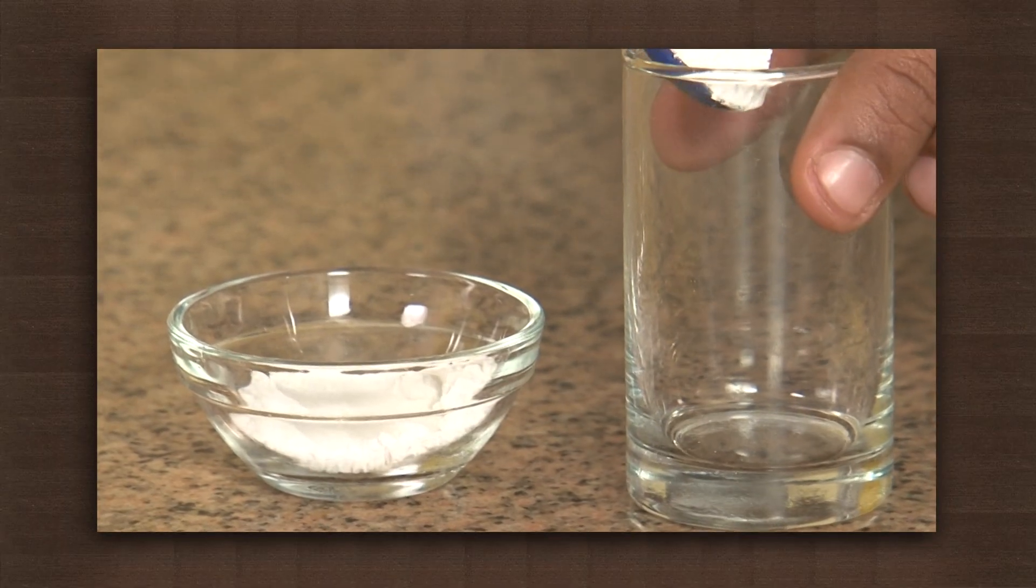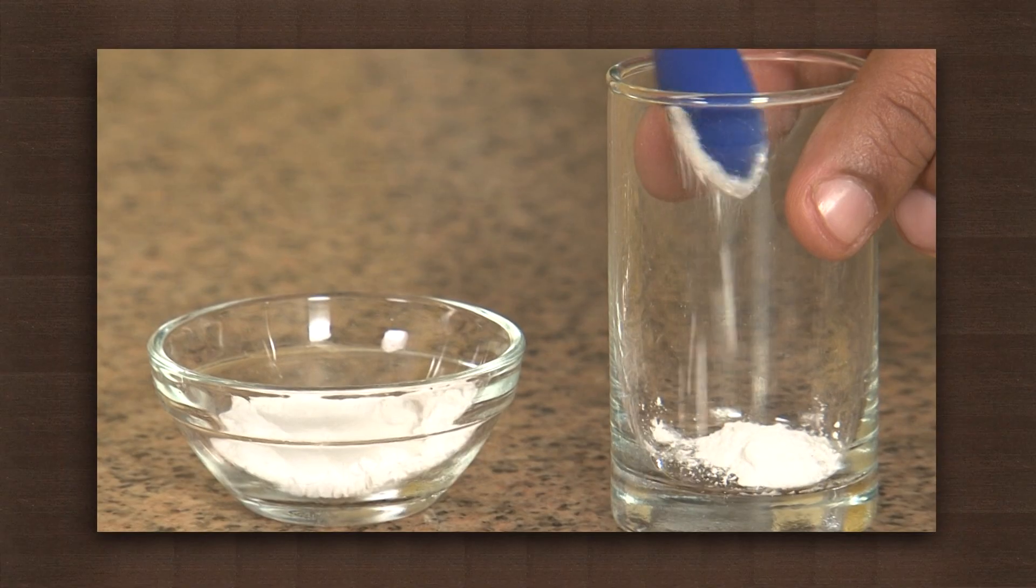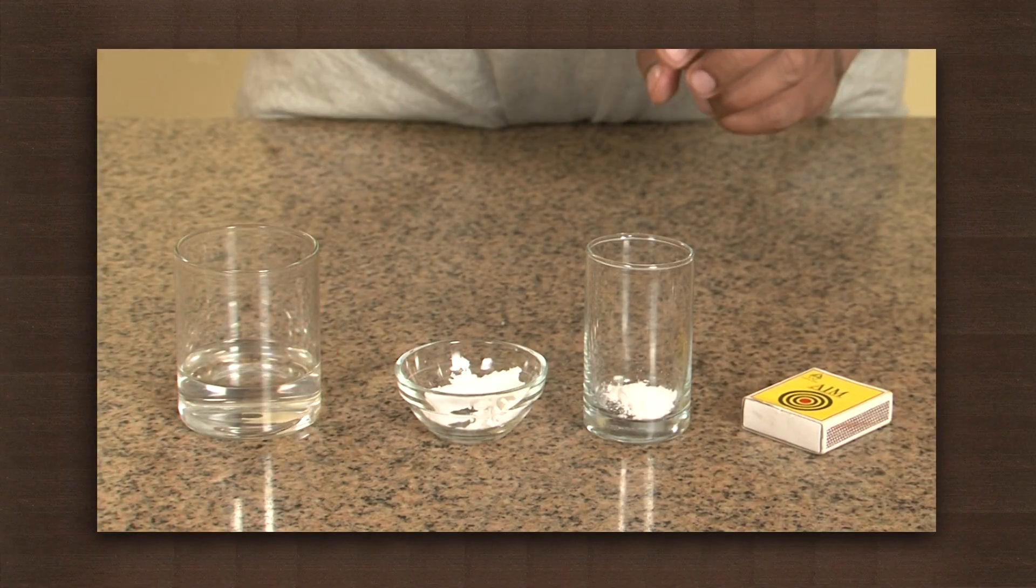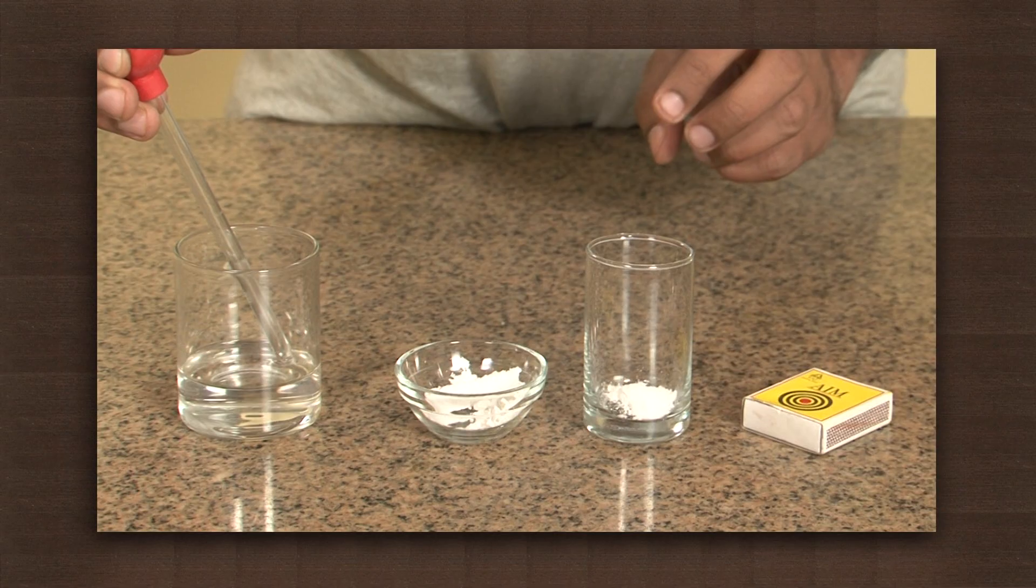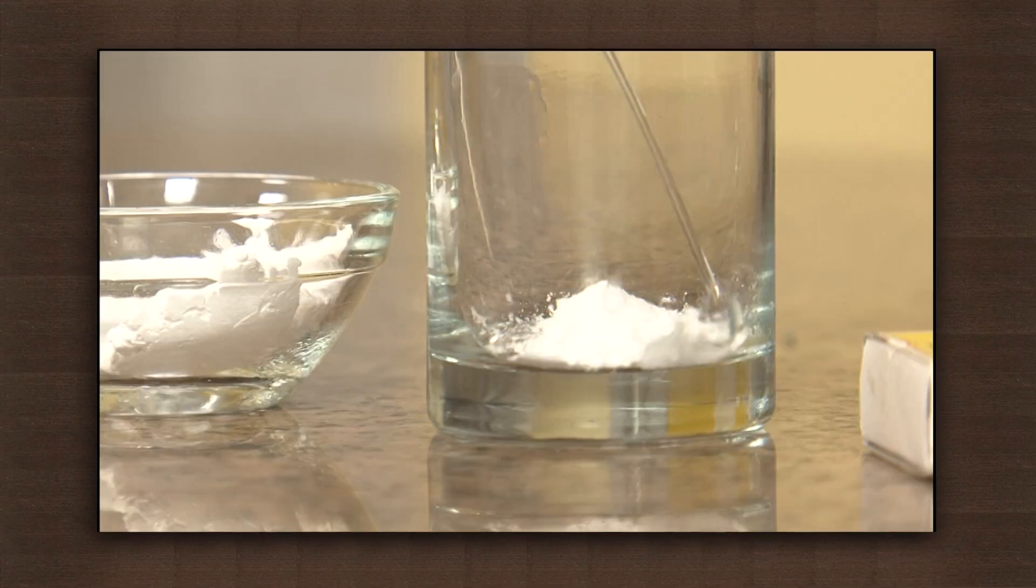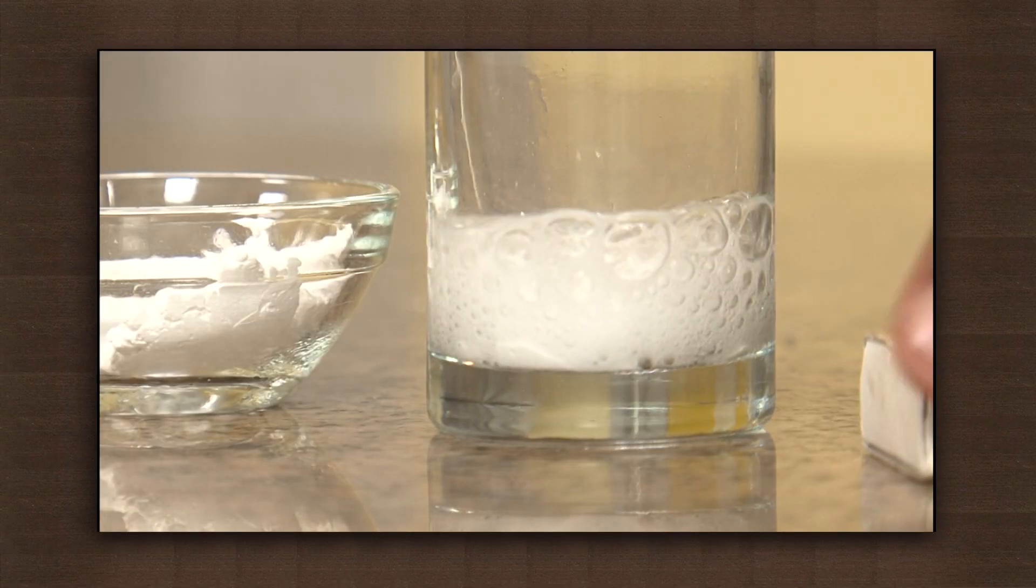Take some calcium carbonate in the beaker. Add hydrochloric acid to it. A gas is formed and released.